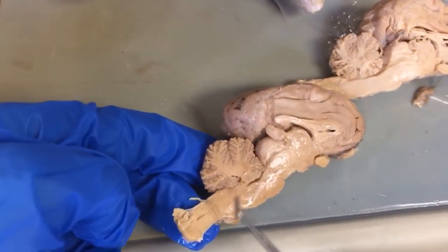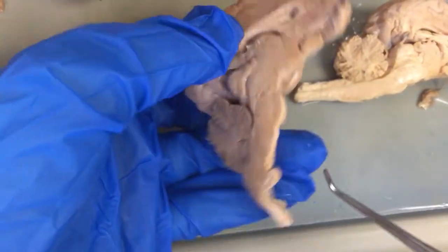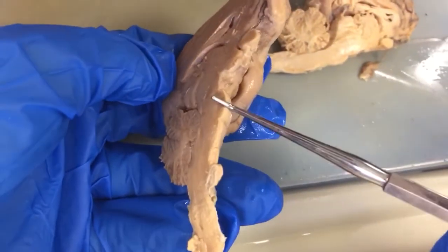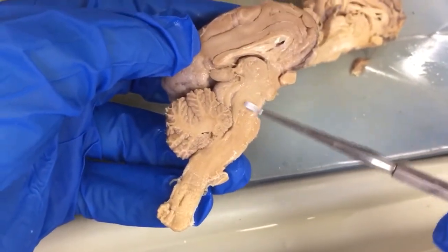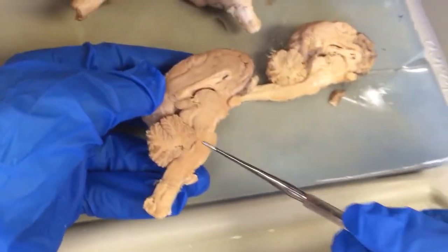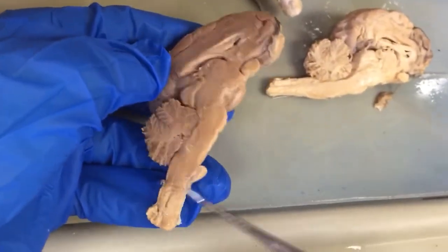All right, and then just looking from the side view, we have the same stuff that we saw in the ventral view. So of course you've got your spinal cord in this section, your medulla oblongata here, your pons here, and then your cerebral peduncle here. Okay, makes sense? So cerebral peduncle, pons, medulla oblongata, and spinal cord.